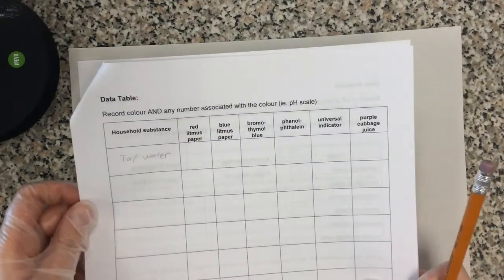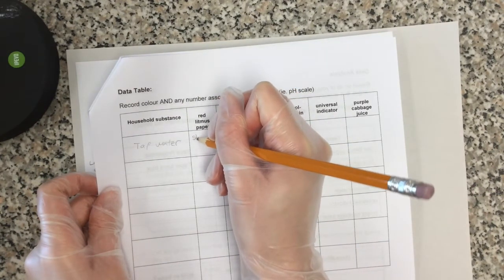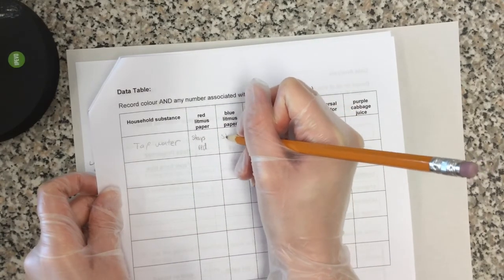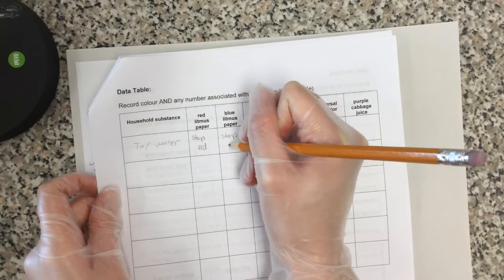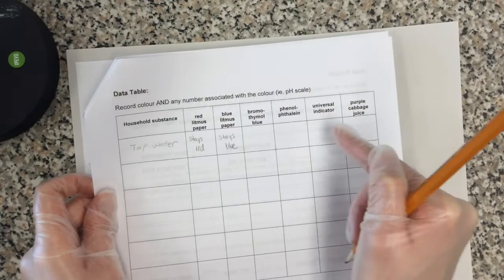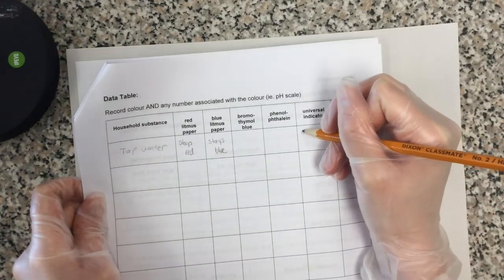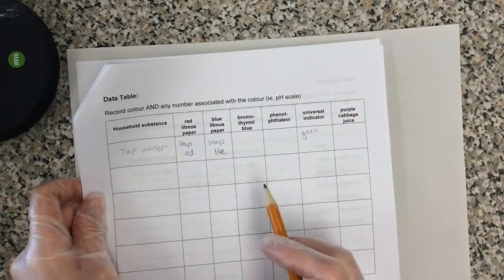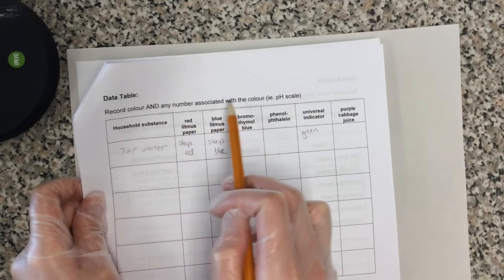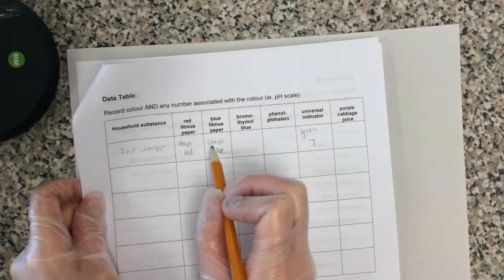Okay, so let's fill in some of this together. So red litmus paper stays red. Blue litmus paper stays blue. We haven't done the bromothymol blue yet, sorry. We're on universal indicator, which is green. Okay, so this wants me to record the color and any pH number associated with that, which we found out was 7 based on the picture. You don't need to include that for these two.